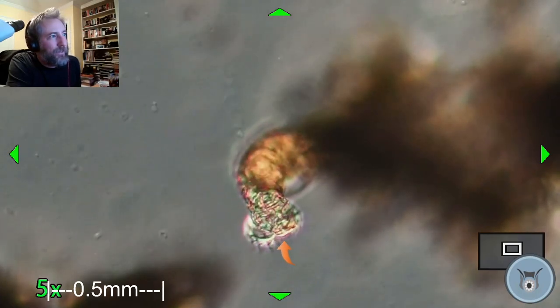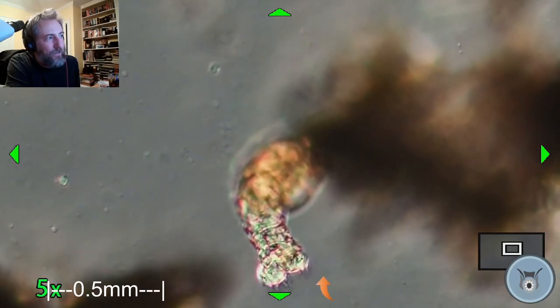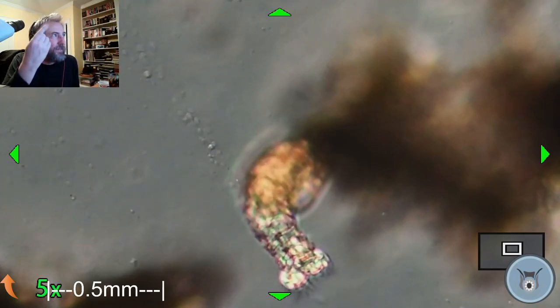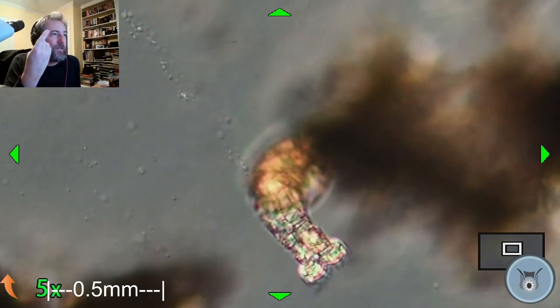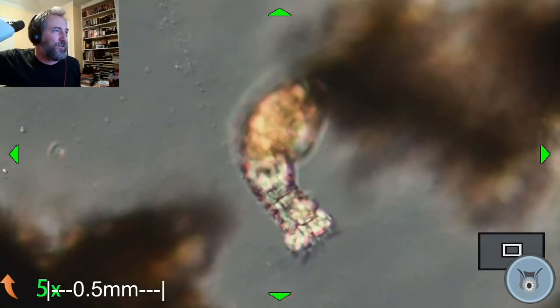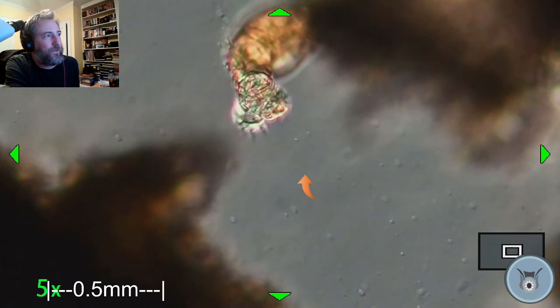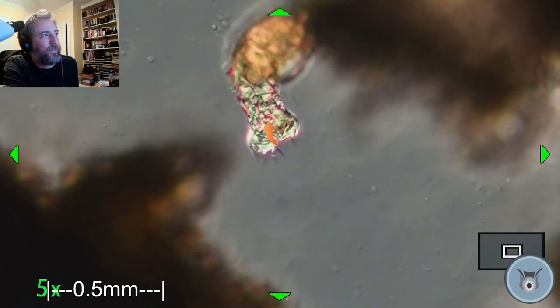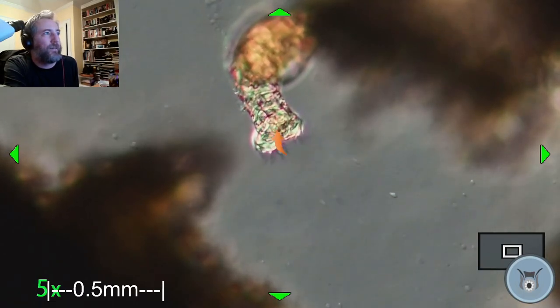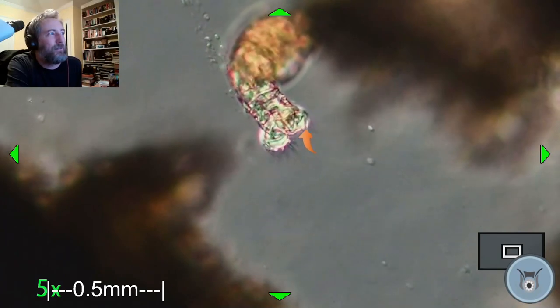Right here, when it spins, you can see the particles are being pulled towards its mouth. And its mouth is in the middle of that, so it spins the cilia in place in tiny little circles, and then all of them together create a sort of draw towards the mouth, and you can see the particles here are being pulled towards it. And some of them go into the mouth, which is basically in here, right in between those two spinning corona ciliates. It's literally making a vacuum. It's like a little vacuum cleaner.